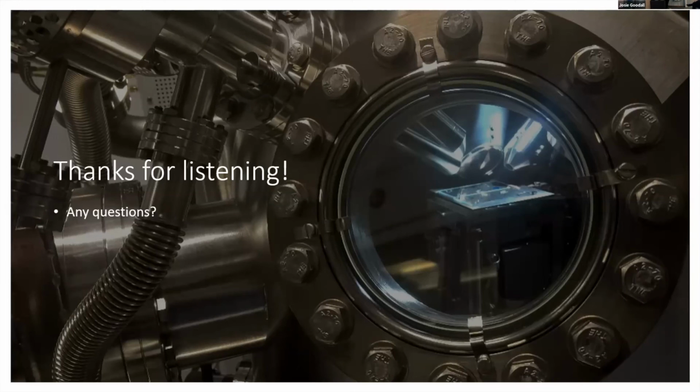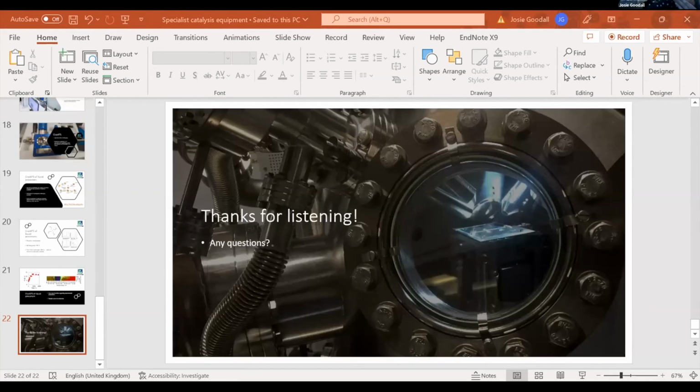The problem we've been having is we get down to -30 and then need to start pumping, and then the more volatile stuff comes off. The new system gets around that: it will sit on a stud which is pre-cooled and then transferred on the same stud, with cooling continued all the way to the X-ray analysis.